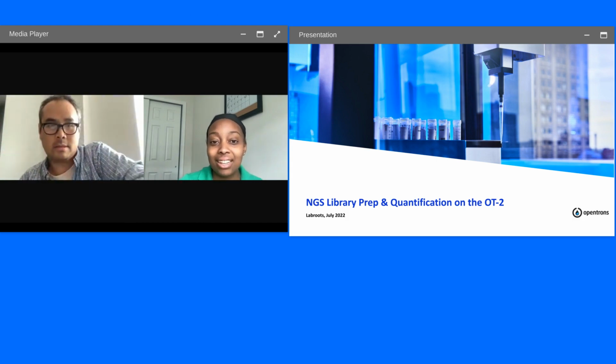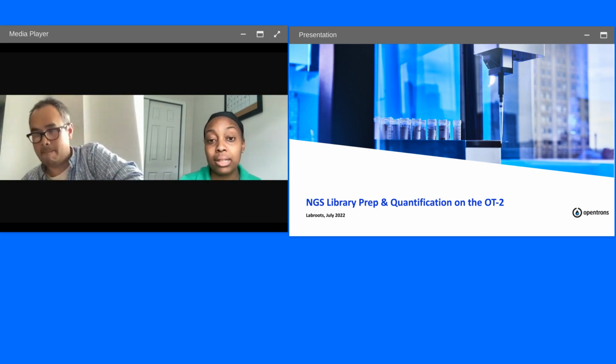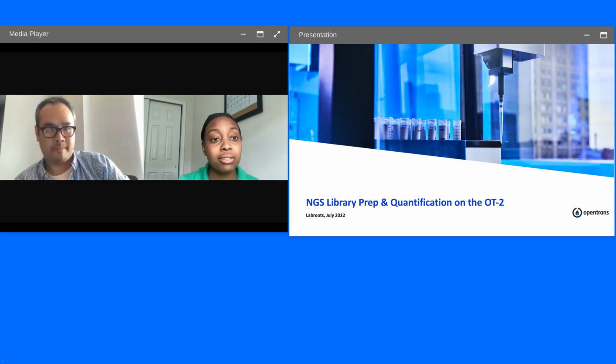Thank you. We have a question here about a low yielding library prep that someone is optimizing, even manually, potentially. Is there anything that you can speak to specifically about troubleshooting a low yielding library prep workflow? There's a lot of steps. The biggest culprits, if you have a protocol that works fine manually versus on the robot, could come down to the way the robot handles it.